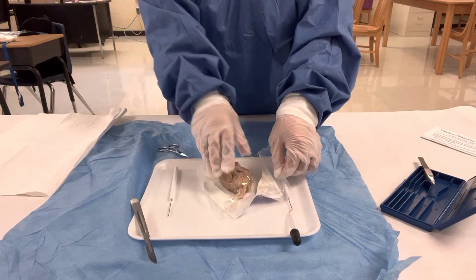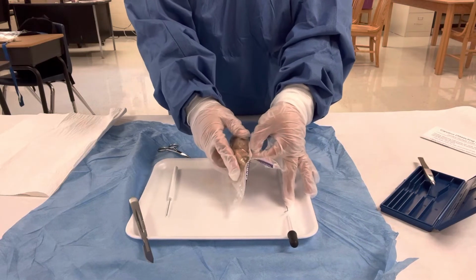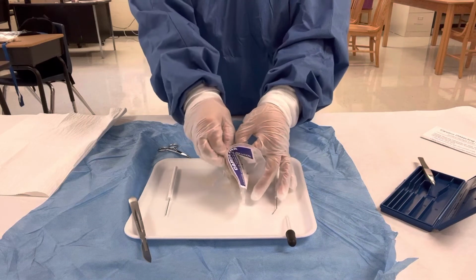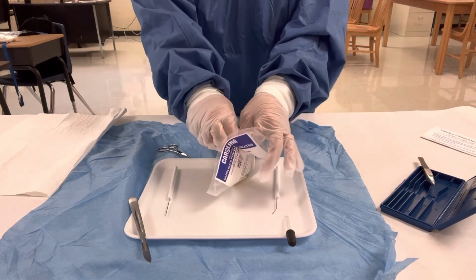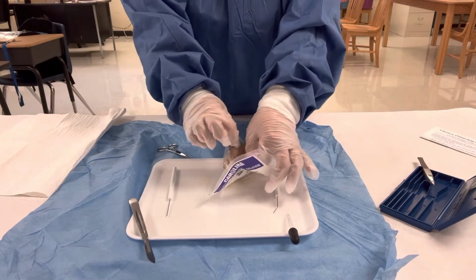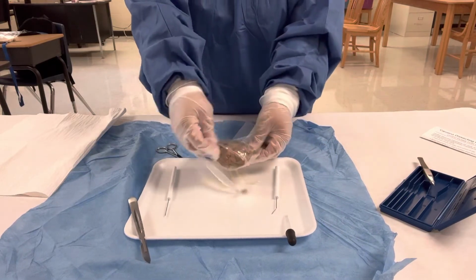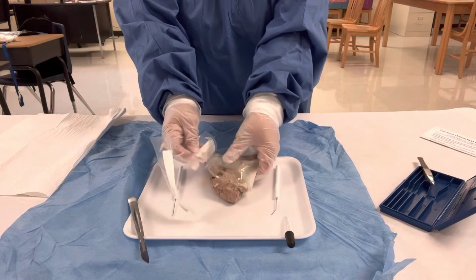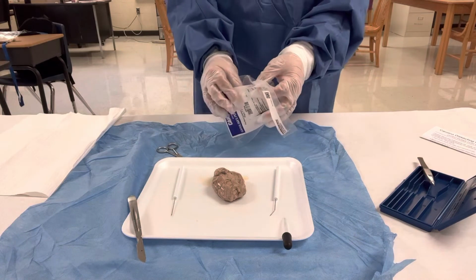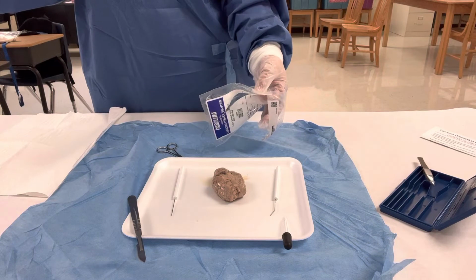This is so disgusting. Jesus. The plastic bag.